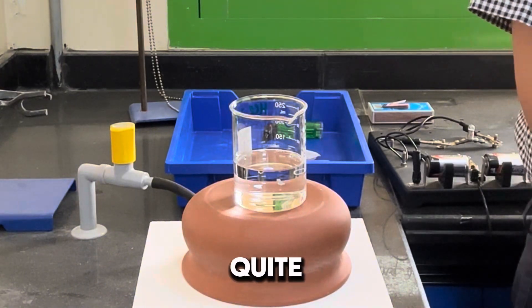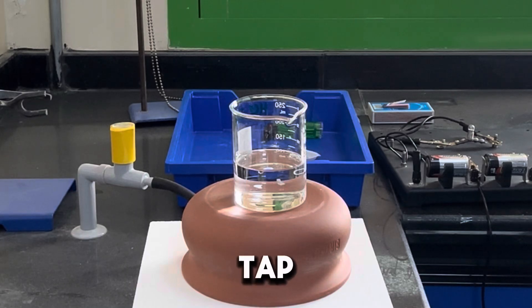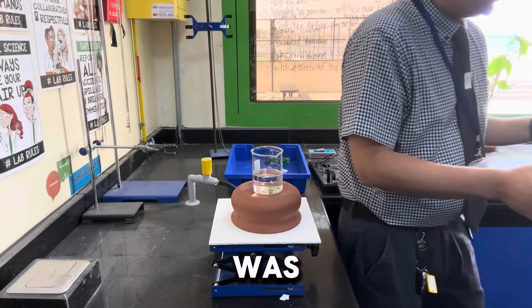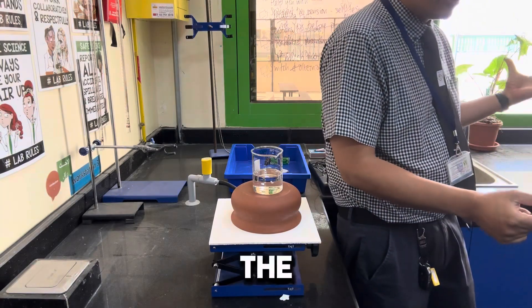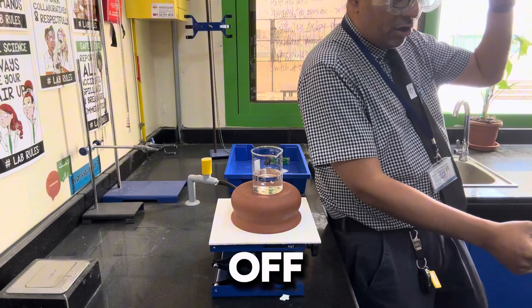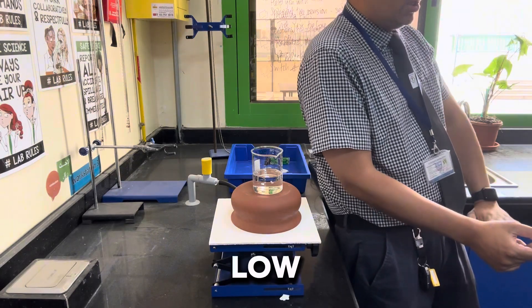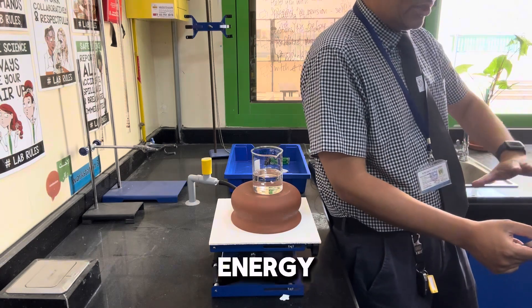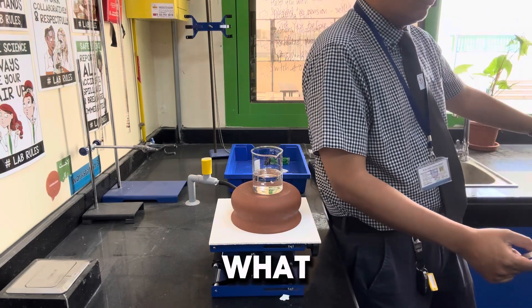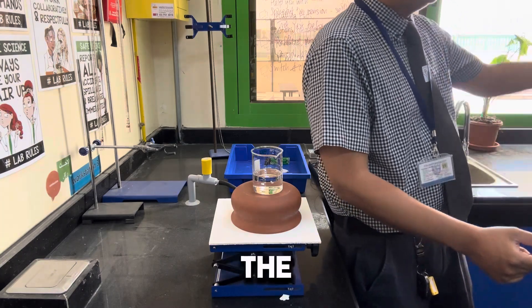It is still quite warm underneath — tap, tap, tap. Did you feel that it was warm? Yes. So energy is transferred to the surroundings. We start off with a high store of chemical energy, and it goes to a low store of chemical energy. Now, where has that energy been transferred to — what store? The thermal energy store of the surroundings.